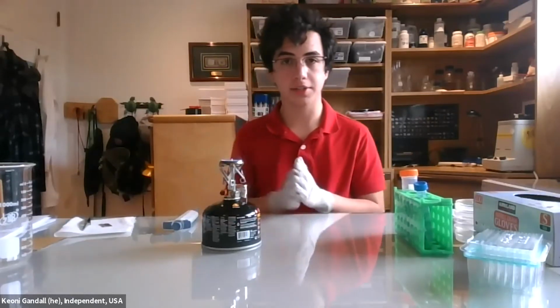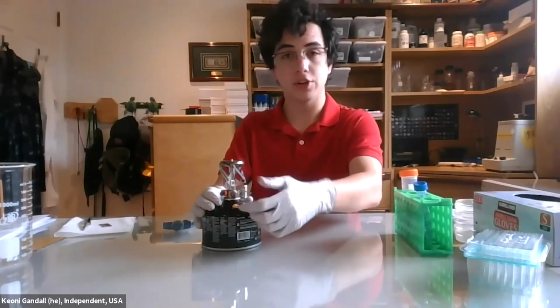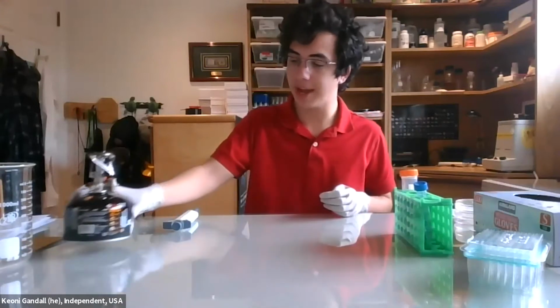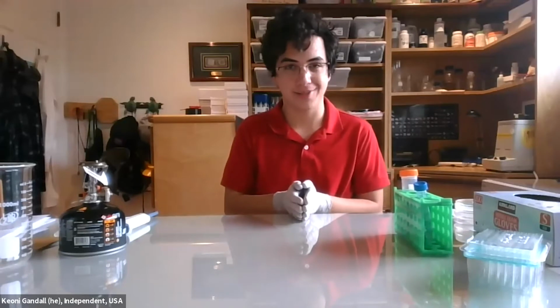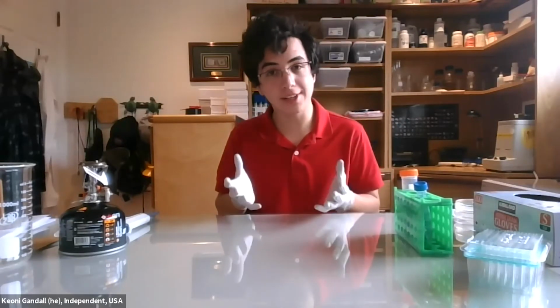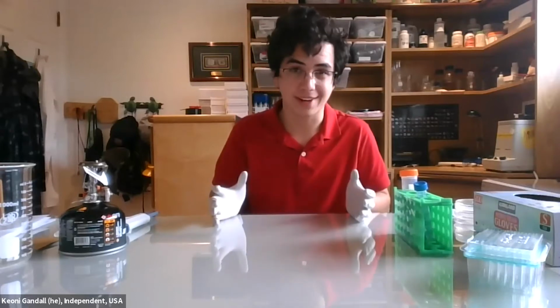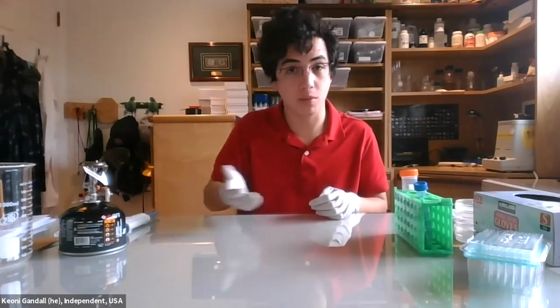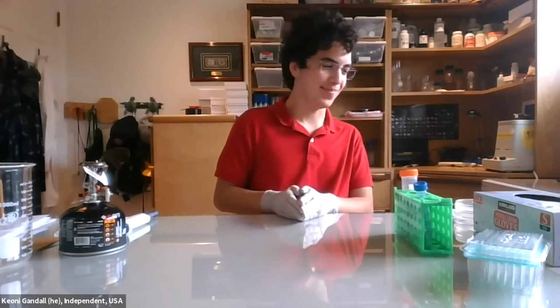And the material costs for doing the Sporenet protocol is so low that you can distribute more DNA than iGEM and Addgene have distributed in the last 15 years for less than $4,000. And so the price of DNA distribution with this method just gets dropped by orders of magnitude, which I hope will allow more people to participate in the upcoming bioeconomy. Thank you.